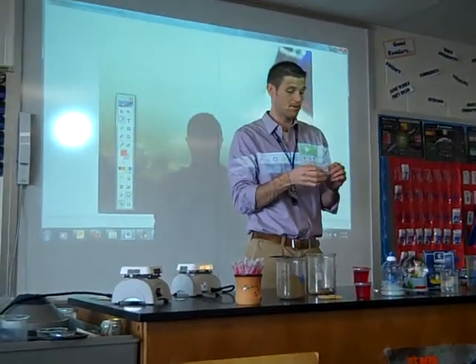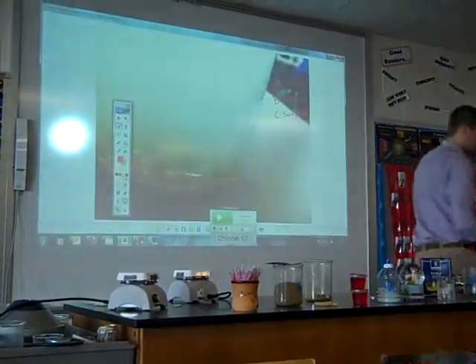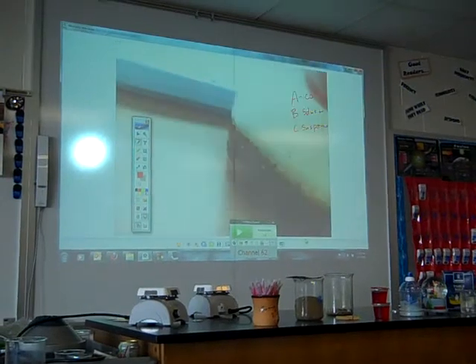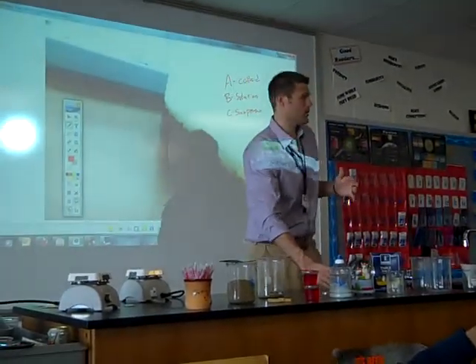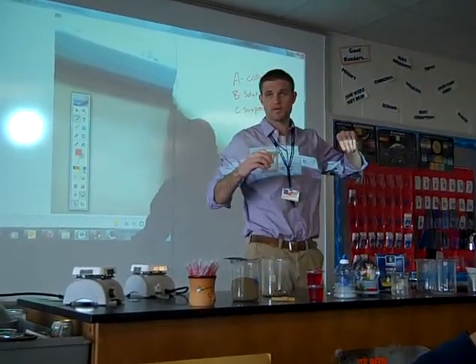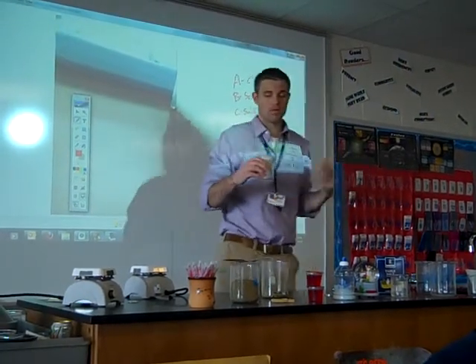What should happen? The water should go through, and what should be left behind? The sand. We'll just do a little bit. All right, there we go. Now I'm going to give you guys a little clue. If something settles out on its own, do you think it's going to get caught in a filter? Yeah, most likely. But we'll still test it.